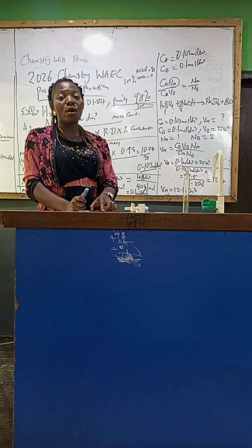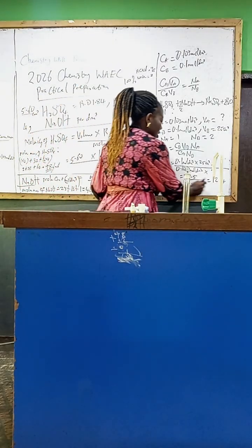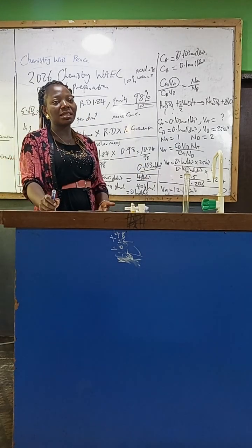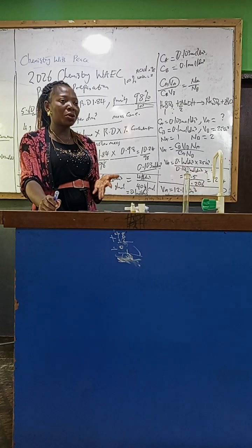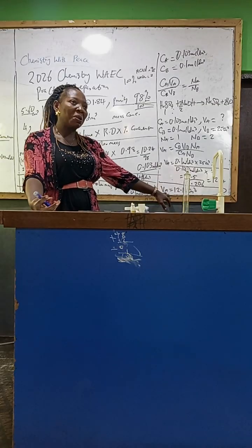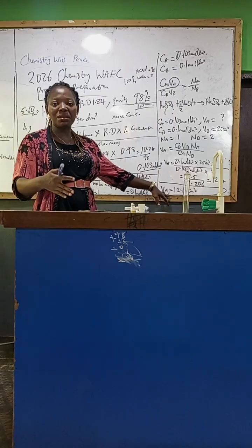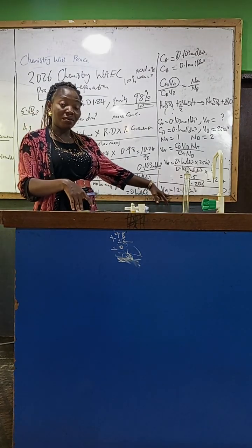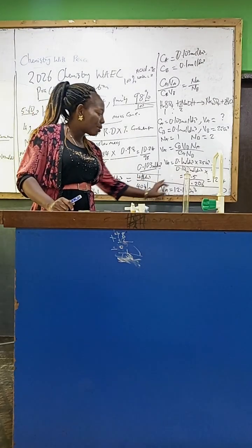This is trying to tell us that when we do our titration, our value should be around this. Not that it should be exactly this, but it should be around it. It should not be too far from it. Are you getting it? So you can get your value from your titration, maybe around 12.1, 12.2, or even 13. In fact, it should just be around this.